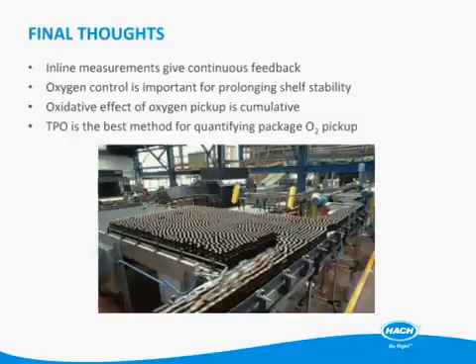If you want to use inline measurements, you can. They give continuous feedback, but that's not to say that a portable can't give you the same data. Oxygen control is really important for prolonging shelf stability, and I don't know of a better method than total package oxygen for quantifying O2 pickup and helping you troubleshoot fillers and areas of O2 ingress.